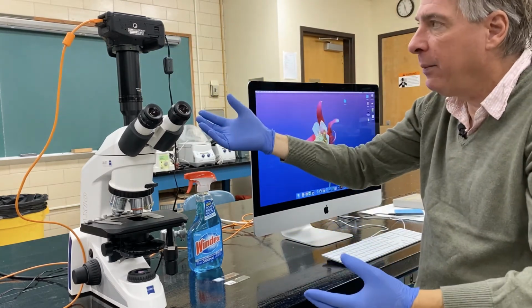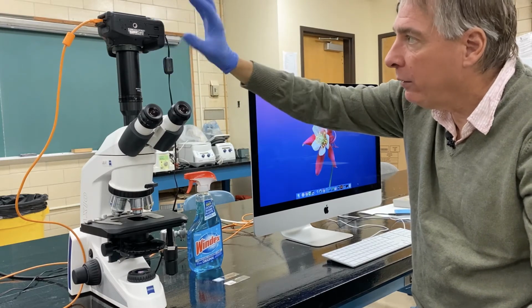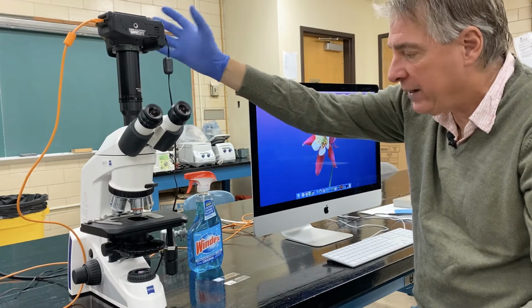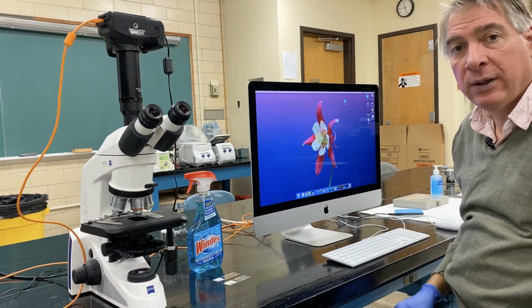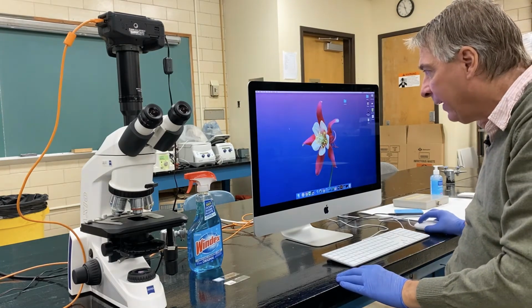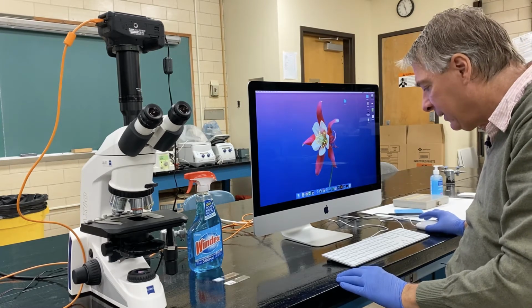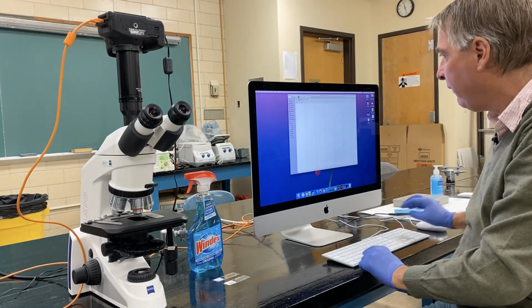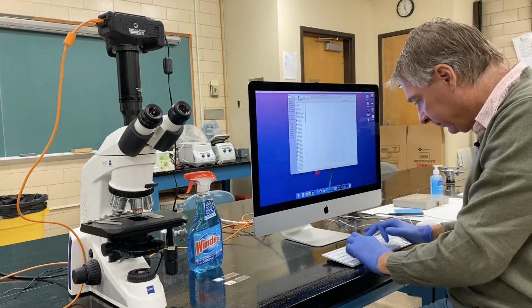Now we can turn the camera on, and the power button for the camera is on the top of the camera, or in this configuration on the back side, and now the camera is on. I then need to power up the EOS utility software. So on a Mac, I'm going to left click the mouse onto the desktop so that I've selected the desktop. Then I'm going to press Command F to open the Finder, and then type in EOS space utility.